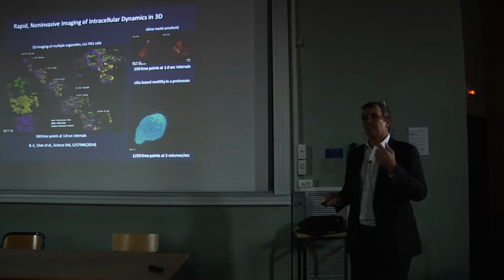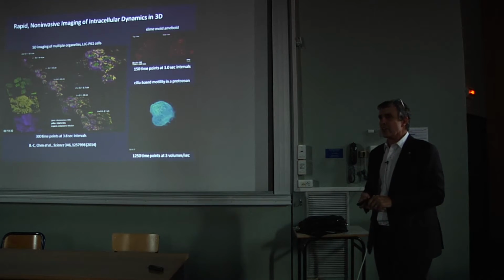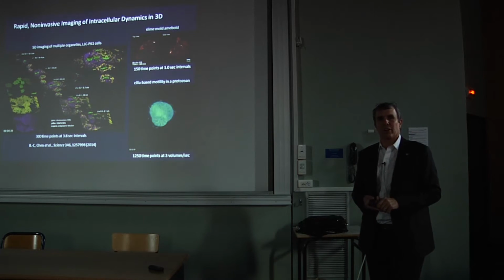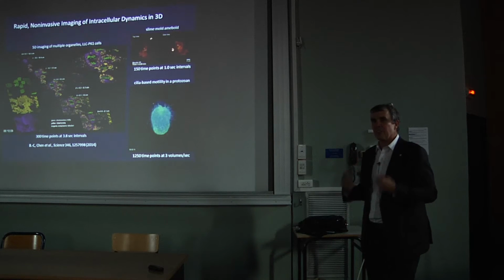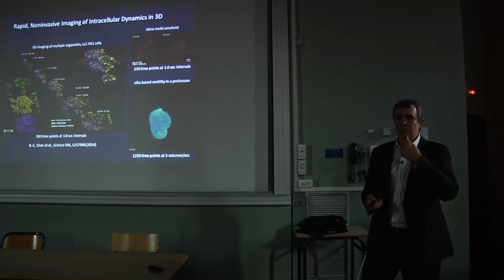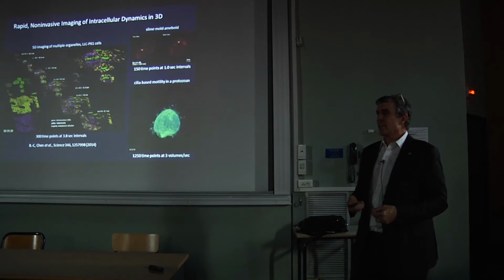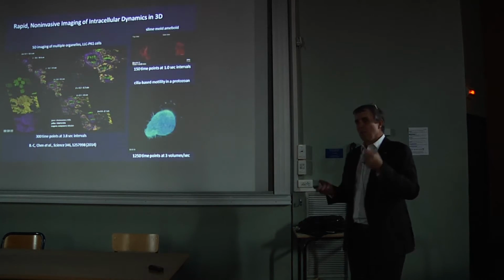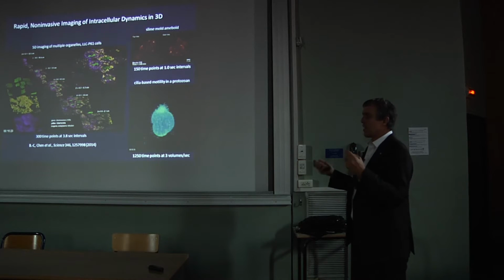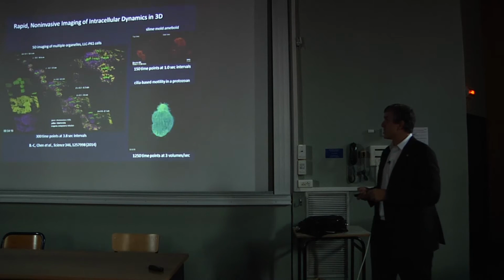But that's one of the things that we've seen with this microscope again and again and again with our collaborators: they are seeing the cell as they've never seen it before in 4 dimensions like this. And there are surprises everywhere. You just don't know what you're going to see. We've had 50 different groups use this microscope. And everybody goes away happy and really surprised at what they see, and with 10 terabytes of data that they have no idea what to do with. And so having better bioinformatics tools, better image processing tools, all of that is absolutely essential to really harness the power of this particular technology.